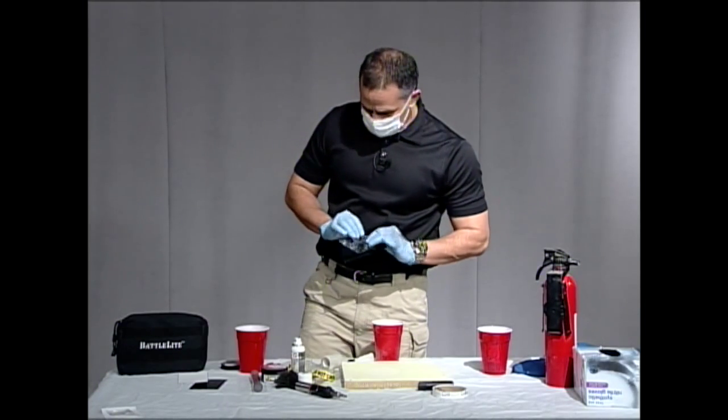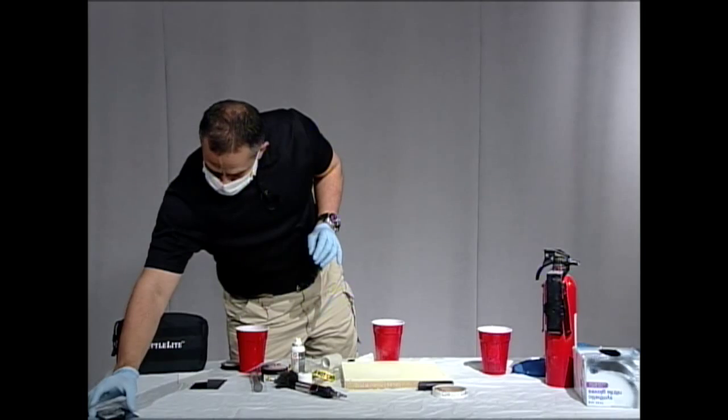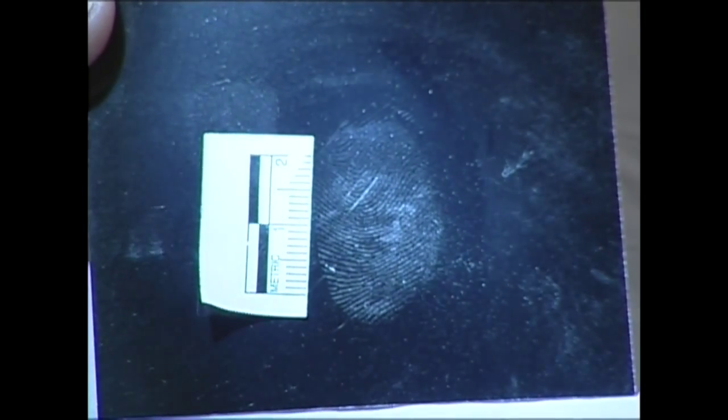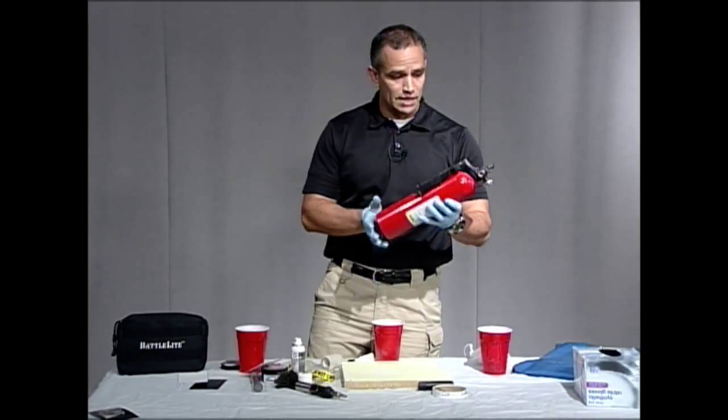I'm going to stick that on our backing — you can see it's a fine powder but it's very light. So we're going to lift it and stick it on a dark background, this one being a black background. And there you have your fingerprint. I'm going to put that in for a close-up as well. So what we have here is a very quick, easy way to develop our fingerprints using our fire extinguisher if we needed to do that outside.